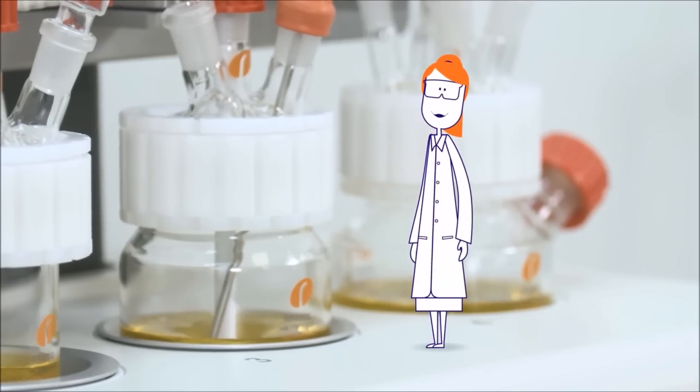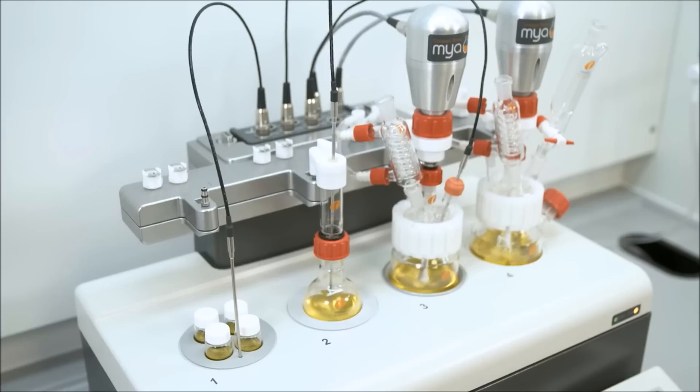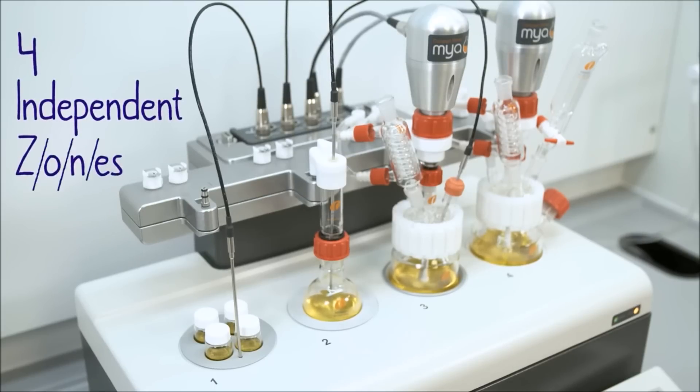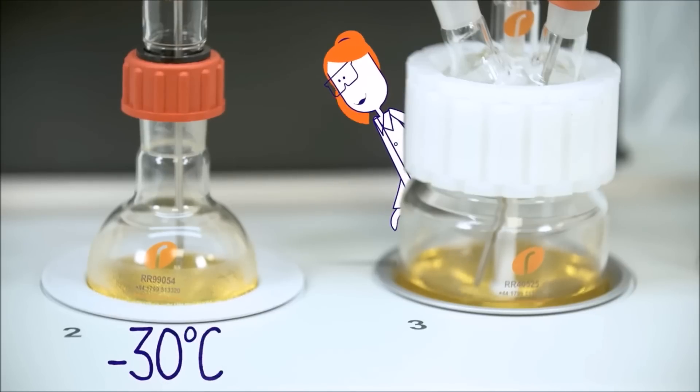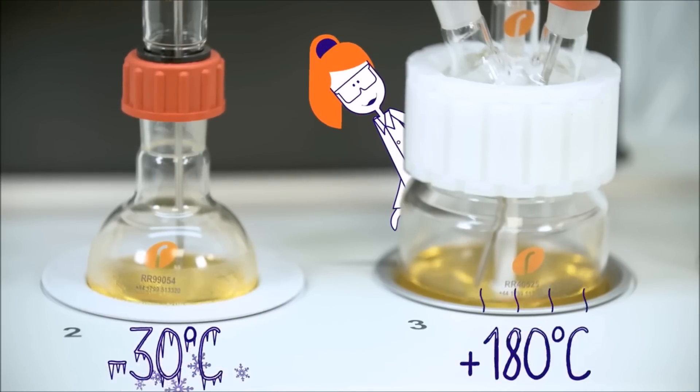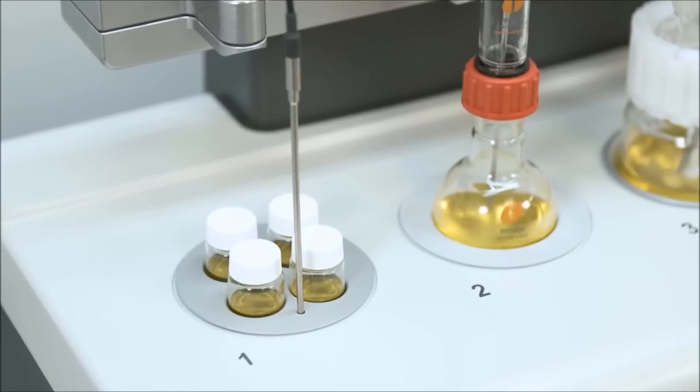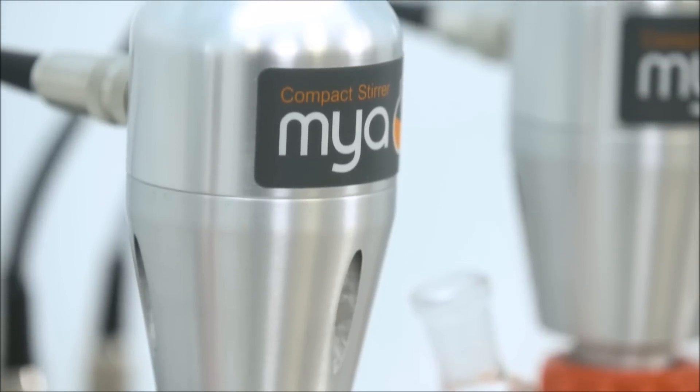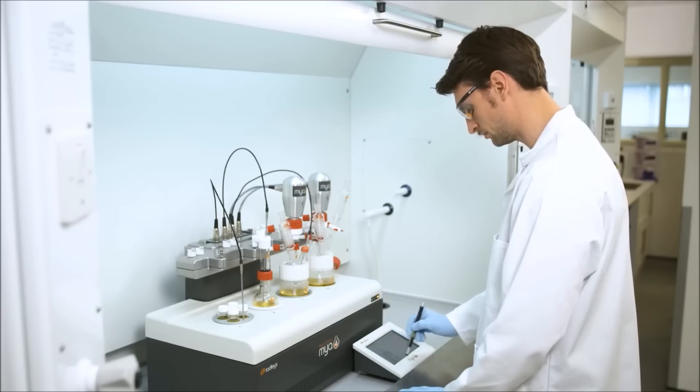Impressed? You should be. Maia 4 will heat and cool up to four positions independently from minus 30 to 180 degrees with a choice of magnetic or overhead stirring. An easy-to-use control pad allows you to make changes to your experiment quickly and easily.